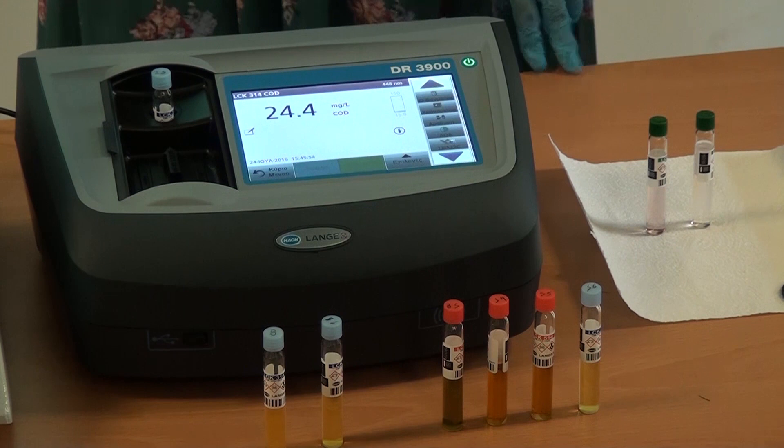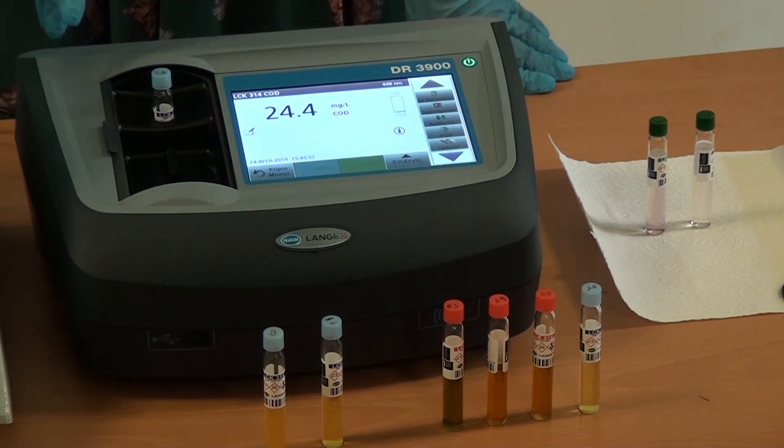I have a camera. Exactly. The same. 24.4.